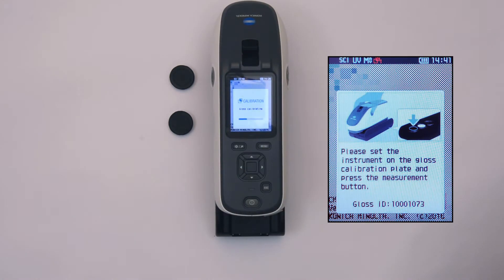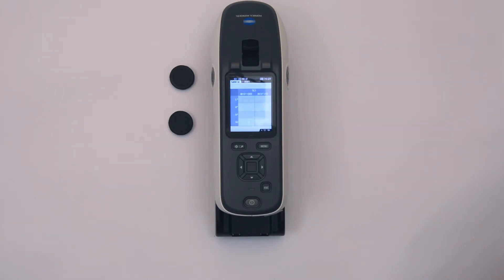Once calibration is completed, replace the caps on each of the standards to protect their integrity.